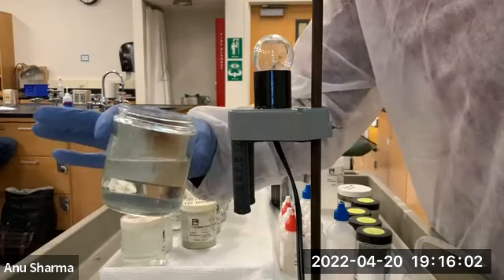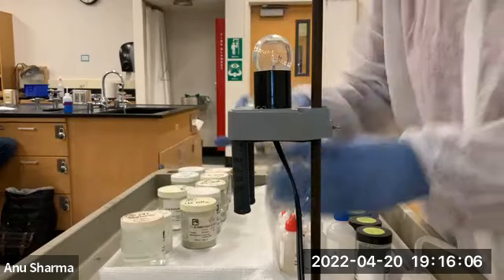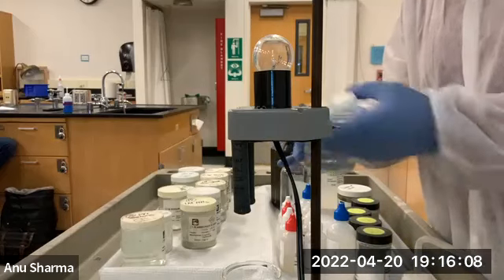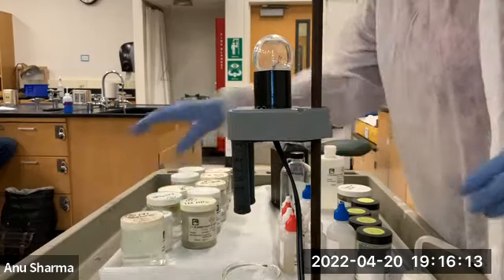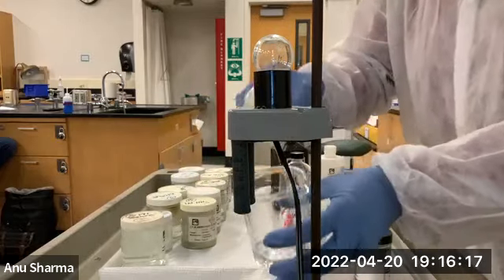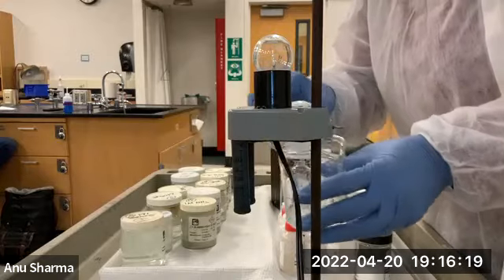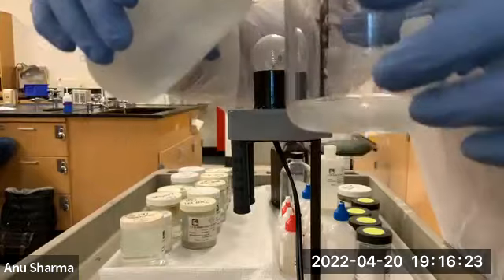This is pure ethanol, C2H5OH. I just added some of it here, closing it back and putting it here. Now I'm going to add some water into it.